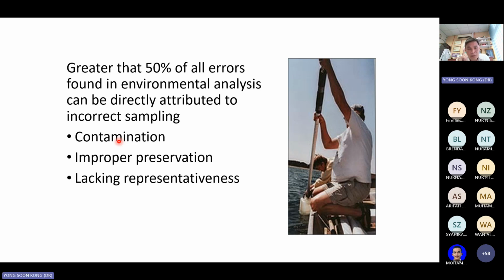It also can be from yourself, your hands. Your breath, for example, if you're into microbiology analysis, every time you breathe out, you also introduce germs or microbes into the water. So these are the things that, depending on how accurate and how precise you want your sample to be, a lot of QA and QC may be applied. They may not be the same, so you have to figure out the entire process of your sampling and analysis.